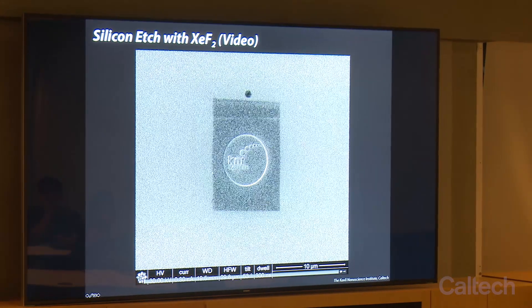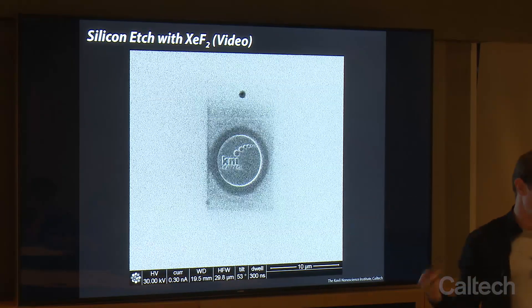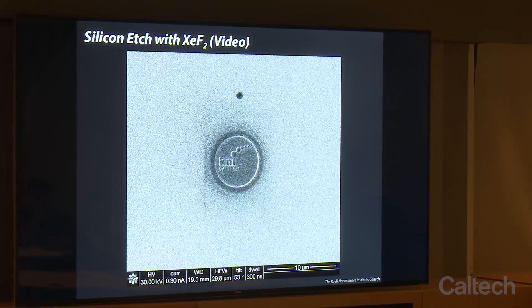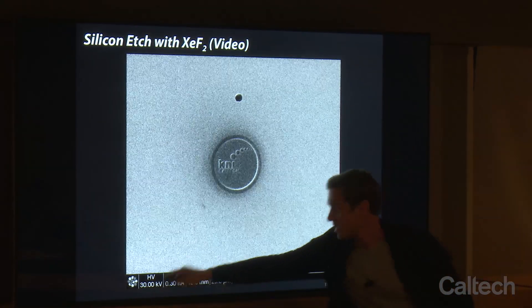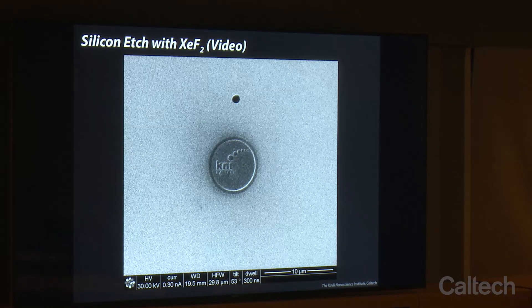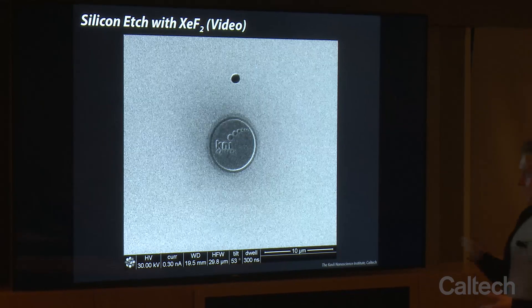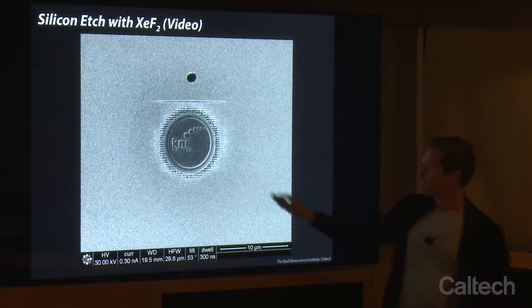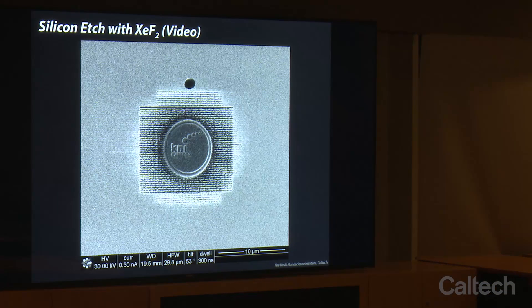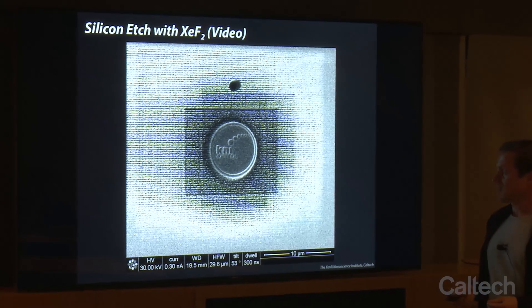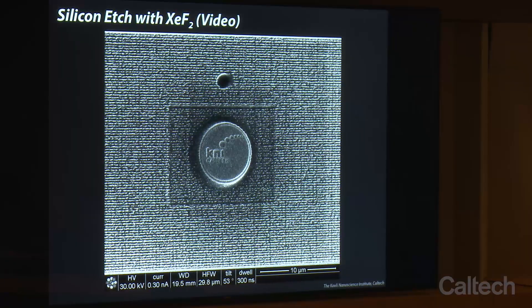On this next slide, I'll show what happens if we flow xenon difluoride gas while we scan the whole field of view with the gallium-focused ion beam. This takes a few seconds to get going — we're flowing in xenon difluoride, and this is an ion beam image, so we're getting secondary electron signal to see what's happening as gallium interacts with the sample and the xenon. In a couple seconds, things really start to open up. The area that already has gallium gets attacked most quickly first, and then it attacks everywhere else. Xenon difluoride is a way for us to increase the etch rate with gallium-focused ion beam.